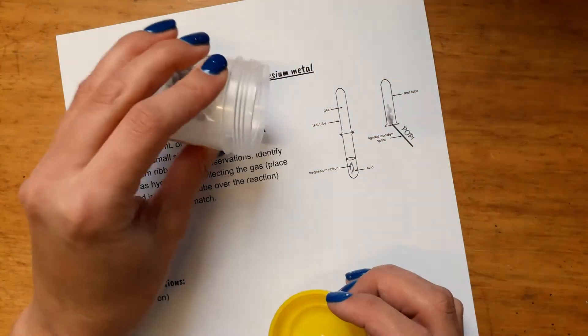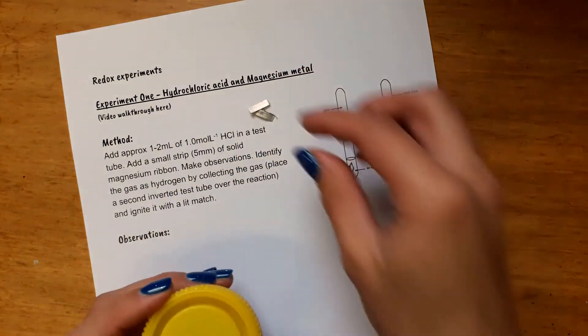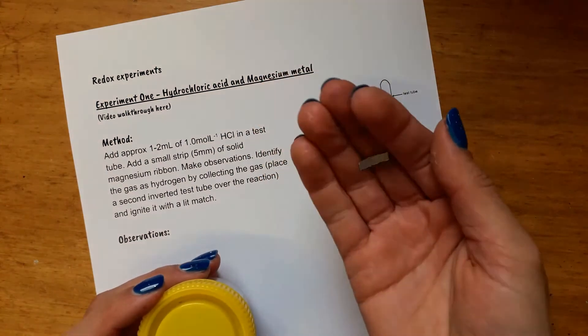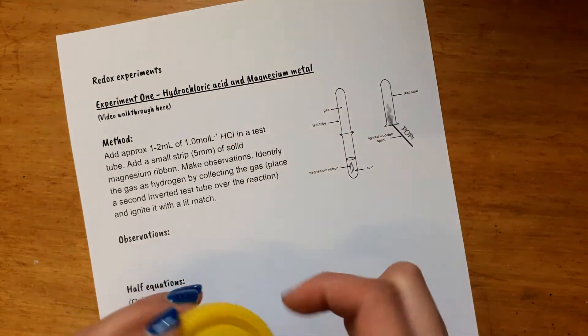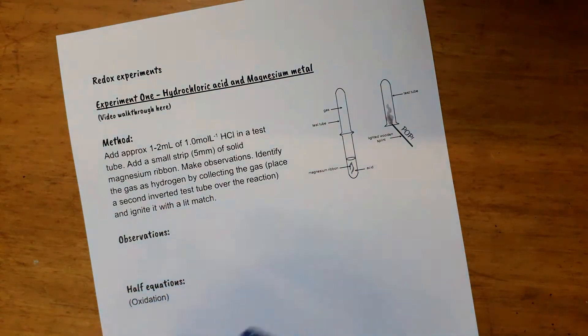I've got some here. It's really small. It's silver. Quite shiny stuff, right? So you'll just put one of those in the test tube and you need to make some observations.